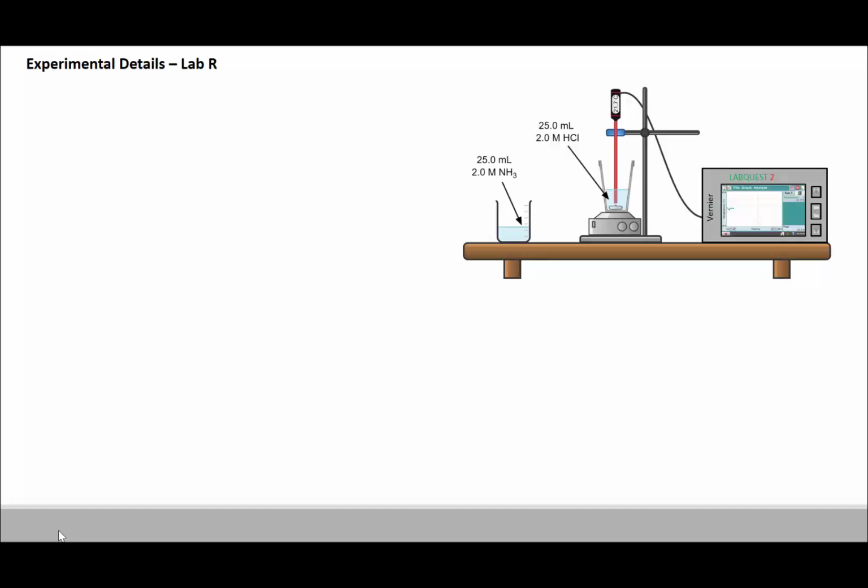Our goal in this lab is to use coffee cup calorimetry to experimentally determine the enthalpy change for two different aqueous reactions. This data will then be used in conjunction with Hess's law to determine the enthalpy change for a chemical reaction not easily studied in the lab setting.